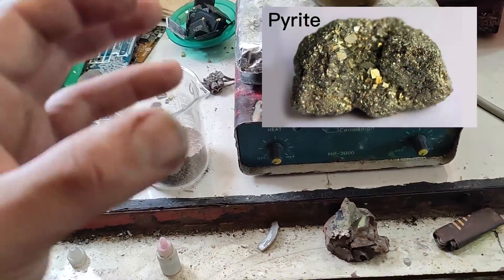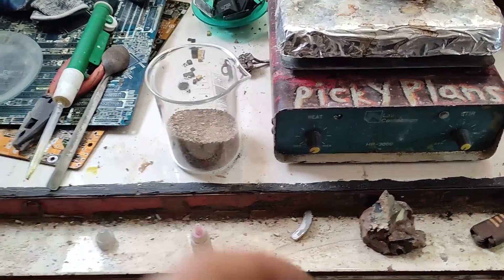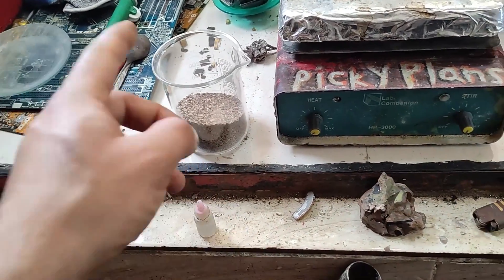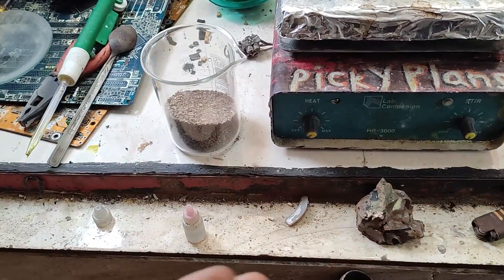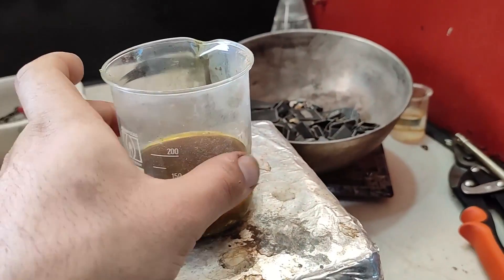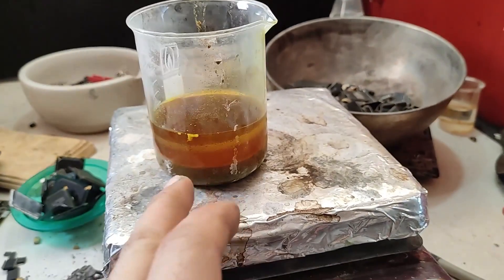This sample is full of sulfides including iron sulfide, known as fool's gold. This causes lots of problems and reduces gold yield. In order to fix that, before recovering gold, this should be roasted at about 500 degrees Celsius in order to oxidize all sulfides to sulfates.